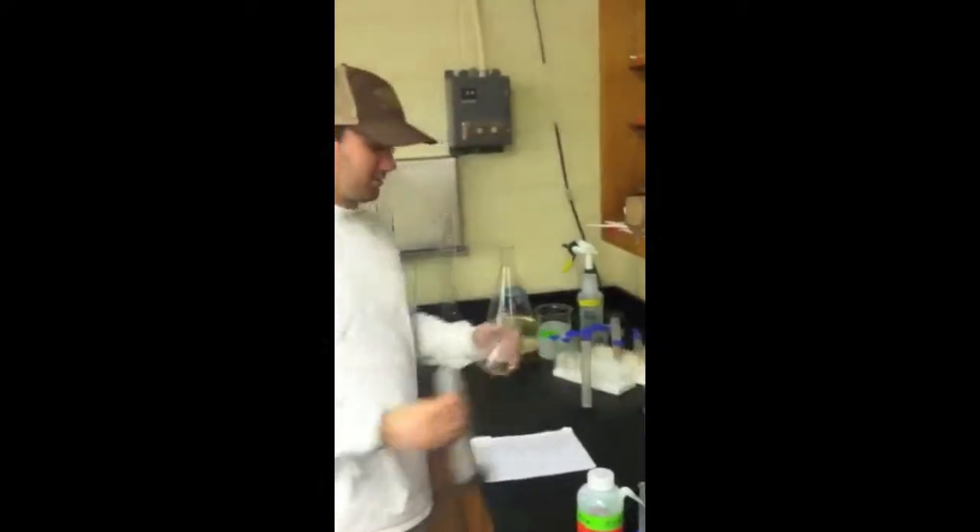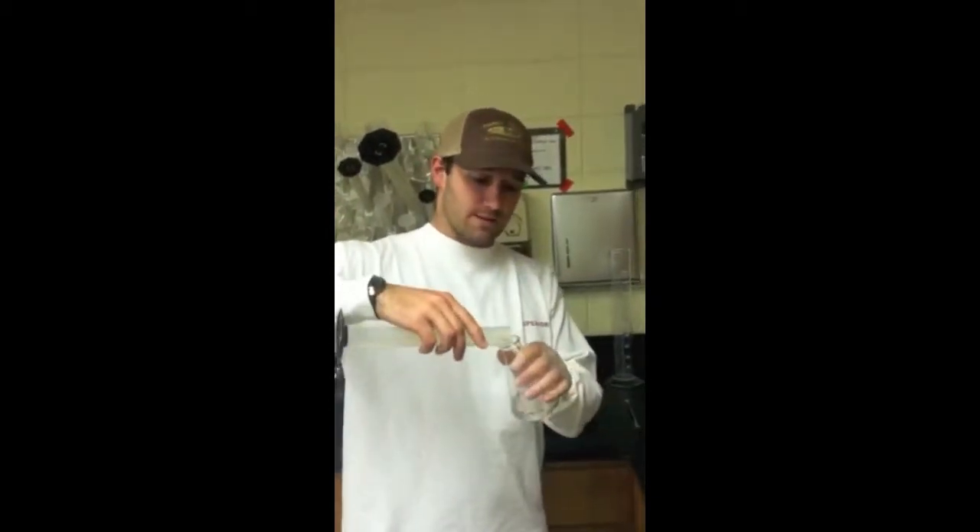Today we're making a 0.8% agarose gel. First off, you need a 250 mL Erlenmeyer flask, and 122.5 mL of DI water poured into the flask.